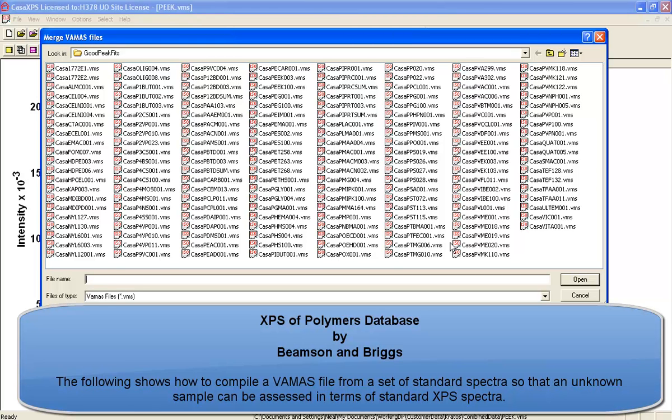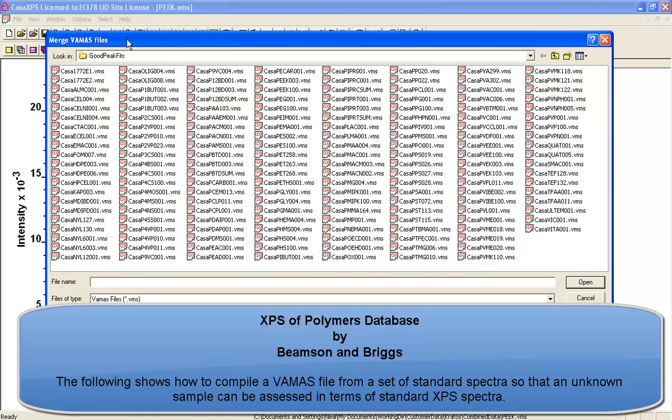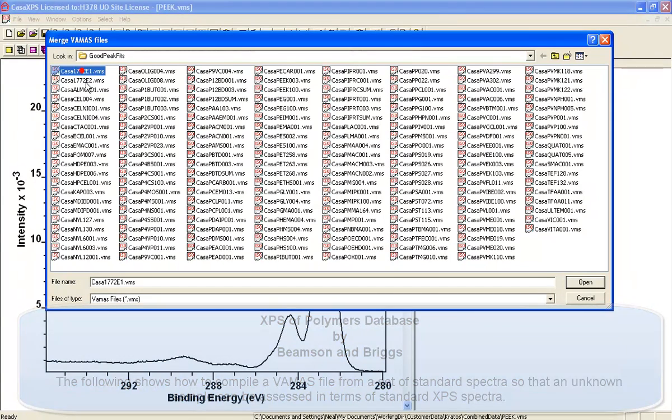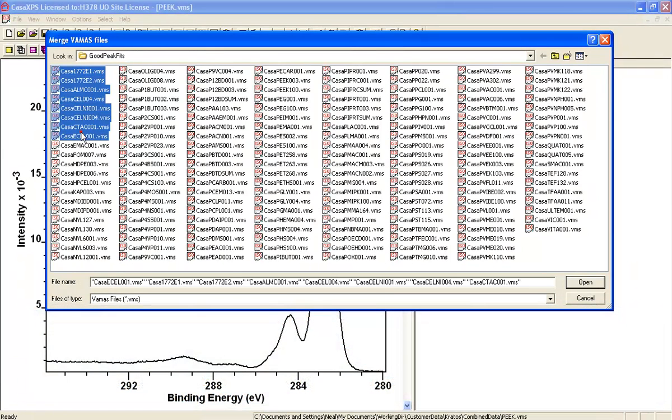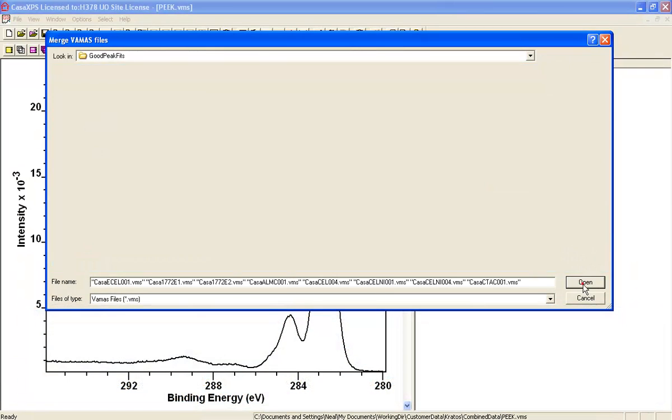This is the Beamson and Briggs database and these are all VAMAS files. What I did was I selected on the file menu the merge option so I can select some of these and load.